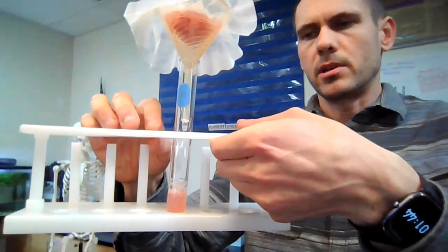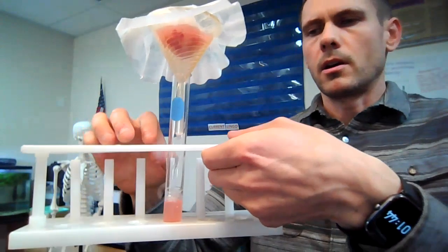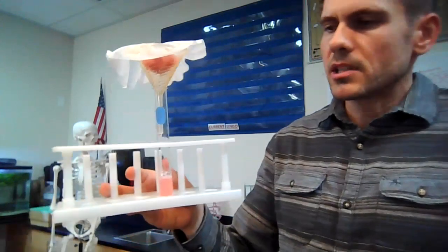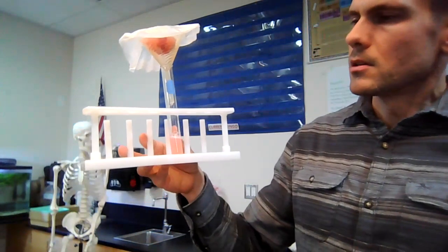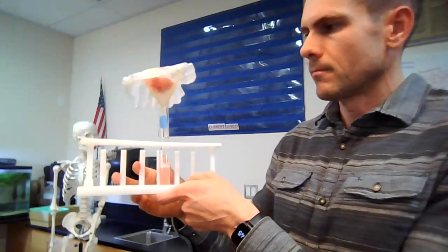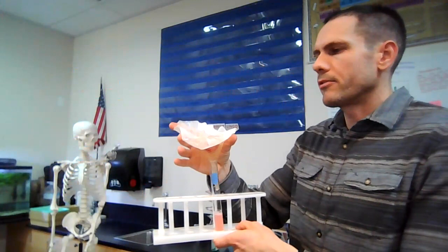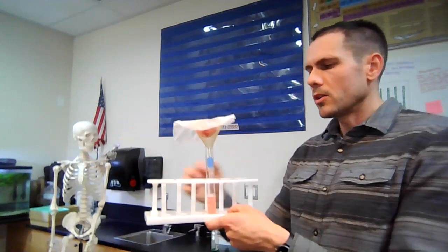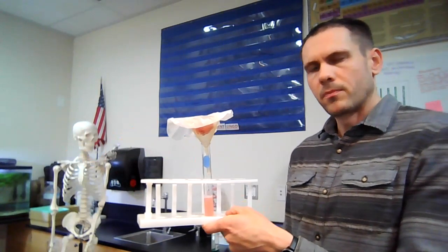It's a pretty pink color. Sometimes you'll need to give it a few minutes, maybe up to 5 minutes, but you just need to go until it's about 2 inches deep. So let it sit for a couple minutes until it's about 2 inches deep. Mine actually went super fast. When it's done, pull off your little coffee filter and put it in the garbage carefully so it doesn't spill. Save your little funnel for later. All you need is the liquid that's in the test tube.